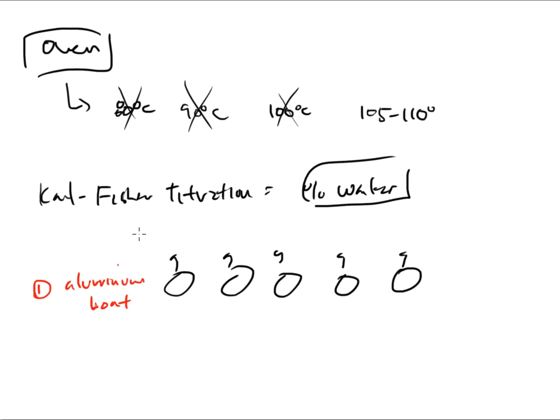Not only that, but you can write on the bottoms of these weigh boats with something like a Sharpie, and it's going to be able to be labeled without a problem. So label them, get your aluminum weigh boats, measure your substances out in them, put them into the oven, and folks, that's really all there is to the lab. That's how complicated it is, right?